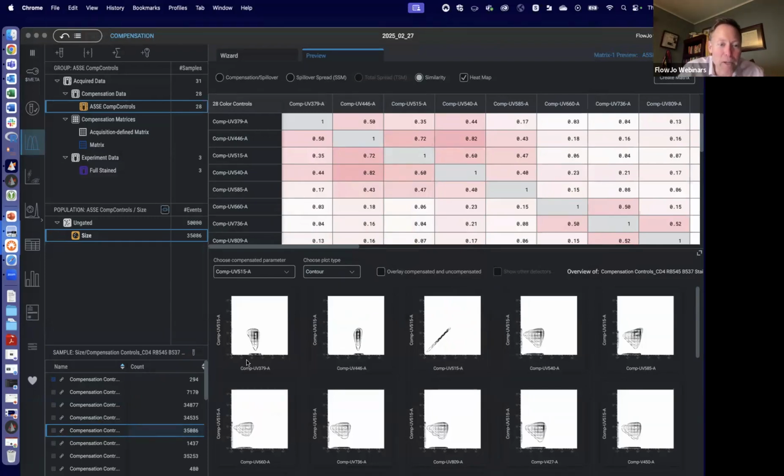Let's see, we've got 2 more open. Can FlowJo unmix Sony spectral data? The answer is generally yes. We have run into some Sony data where we do a poor job of figuring out what kind of FCS file it is. Is it 3.0, 3.1, 3.2, etc. And it gives us some problems. Still working to improve that, but I think in general the answer is yes. And then specific cytometers, their newest cytometer, I think puts out a 3.2 version file? Anyway, I've heard some folks have trouble with Sony. So good question, Francis.